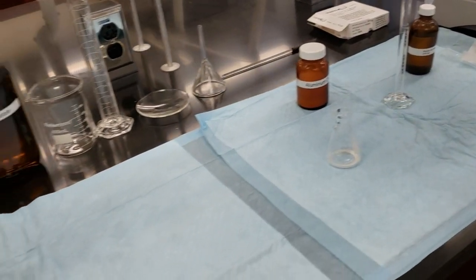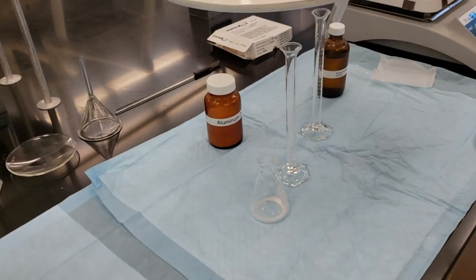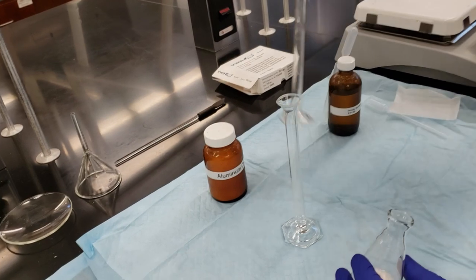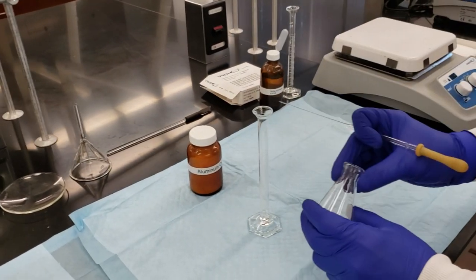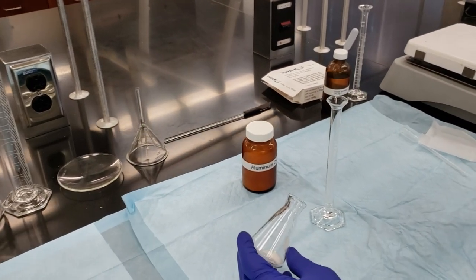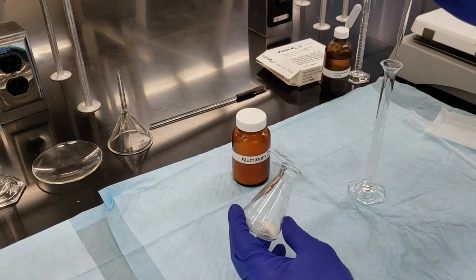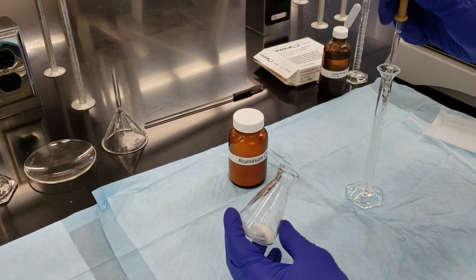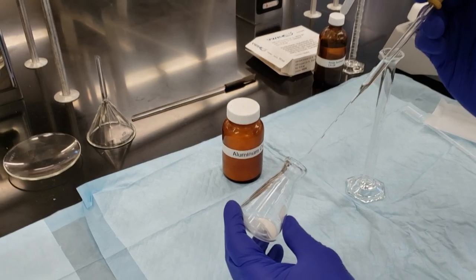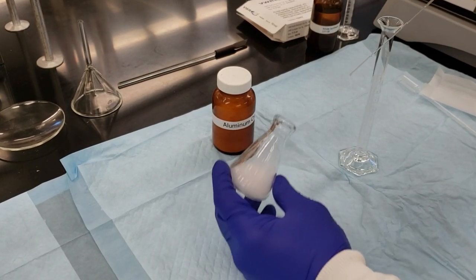Set that down. Then I'm going to slowly add my 1 mil of acetic anhydride. This also has a very pungent smell to it. So we're going to be very careful. Let's move some of this out of the way. We're going to be doing this drop-wise because this is a very exothermic reaction. I'll hold my Erlenmeyer flask at an angle and add about one drop every 3 seconds. And I'm going to swirl each time I add a drop.